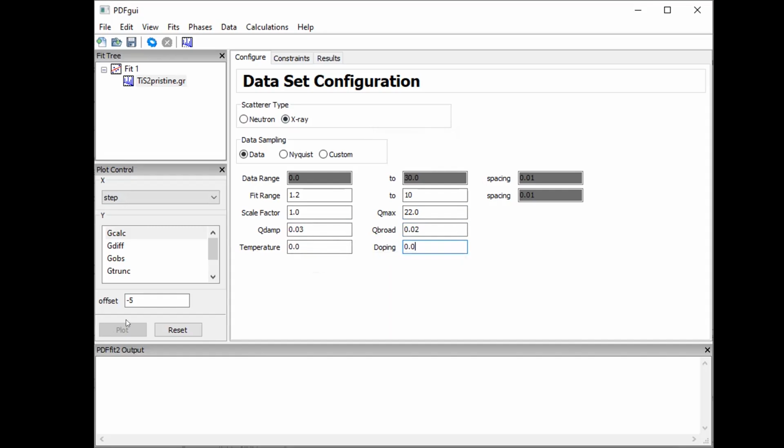You can plot here, and you can choose x as, for example, the bond length or some specific parameter, and I'm sorry, x as the temperature. I think it's not shown here because we did only one data fitting. If you do multiple data, there will be a temperature showing here. So you can select x as temperature and y as some specific physical parameter and see how the trend changes. The same thing is true for the doping. Okay, so this is the data.